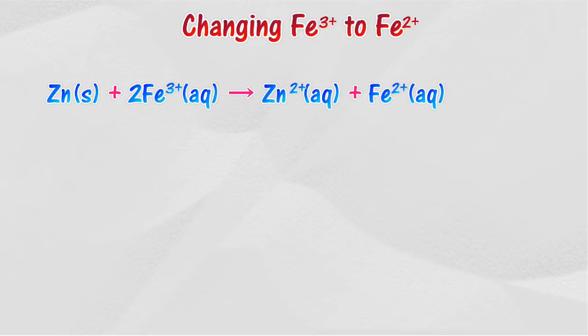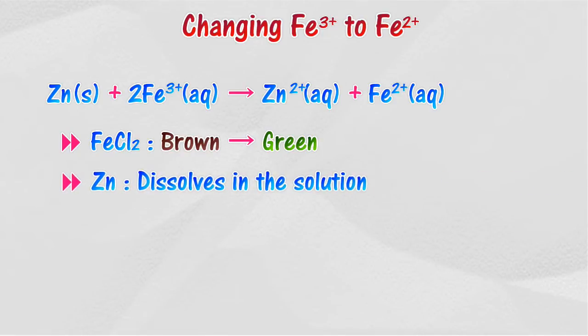This is the ionic equation for the reaction. A brown ferrum 3 chloride solution changes to green. Zinc powder dissolves in the solution.